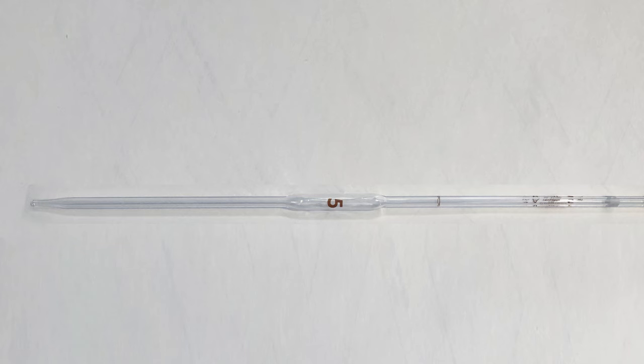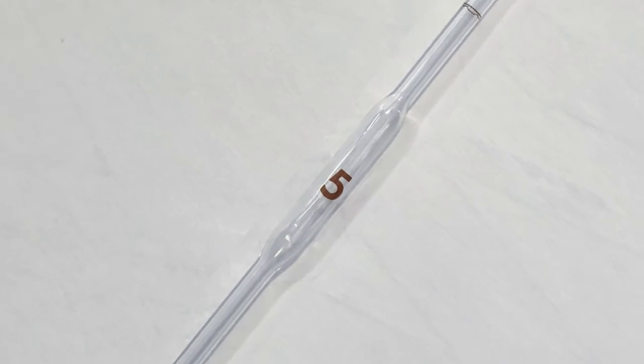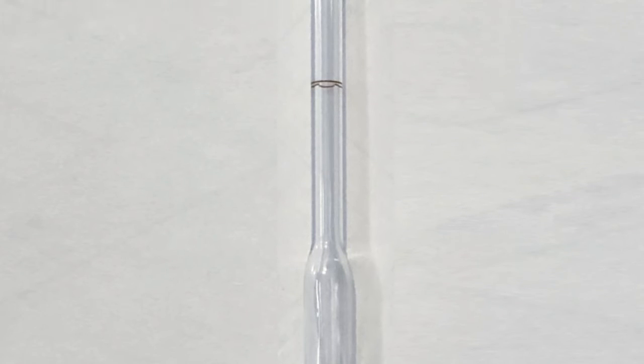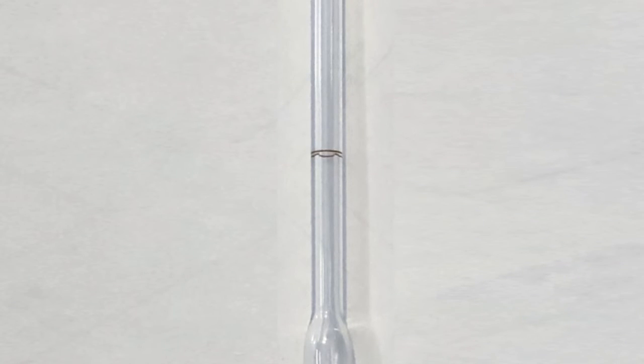A transfer pipette is meant to deliver a specific volume. It has a mark near the top. Fill it so that the bottom of the meniscus is on this line.